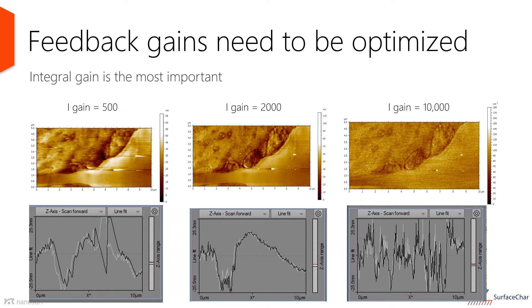Feedback gain is the last, but not the least, parameter to be optimized. The image acquired with ideal gain is shown in the middle of the slide. Too low a gain results in smears and streaks, most evident when comparing line profiles of forward and reverse scans, which do not match when gain is too low — the feedback loop is too slow and cannot faithfully track the surface. Too high a gain causes self-excitation of the feedback loop, producing noise known as ringing, seen as high-frequency oscillation in the line profile.